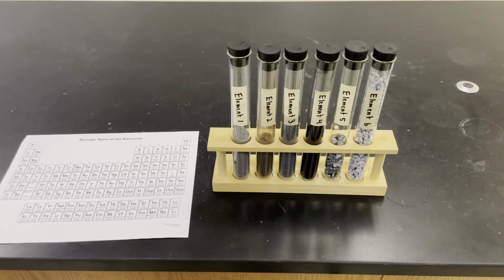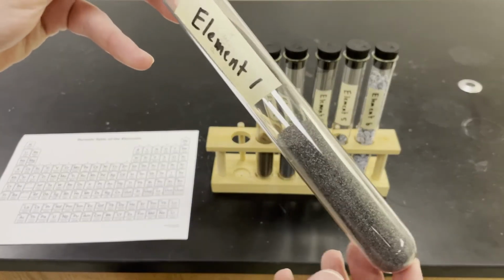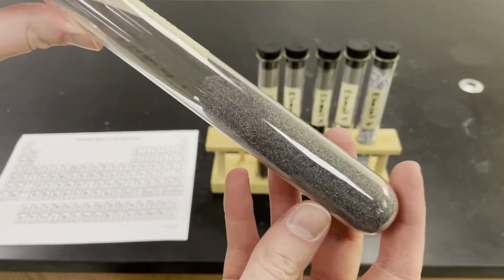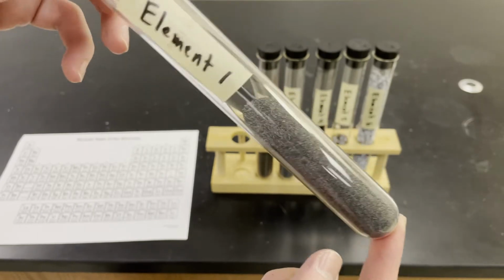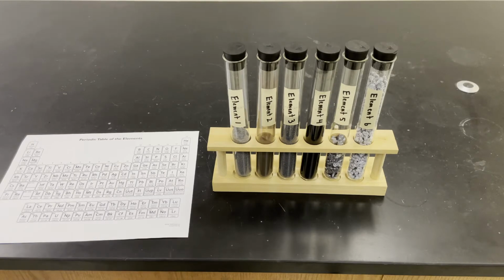Since we're just doing this via video, instead of actually doing mass measurements and putting them out on a scale, we're just going to talk through them. So this test tube here, element 1, contains this kind of dark gray powder. This is, again, a pure element. There's 1 mole of it. If I measure this on a scale, there are 24.31 grams of stuff in here, 24.31 grams of this element, and there's 1 mole of it. That means that this element has a molar mass of 24.31 grams per mole.